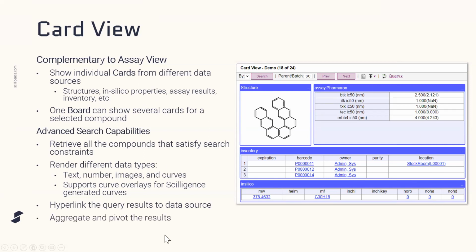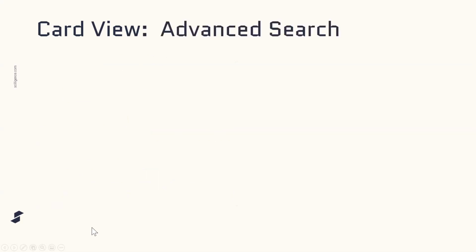You're also able to aggregate and pivot the results. I think I have a slide on that coming up. But the beauty of it is now you have a compound-centric view in FOCUS. Okay, yeah. All right. Advanced search.